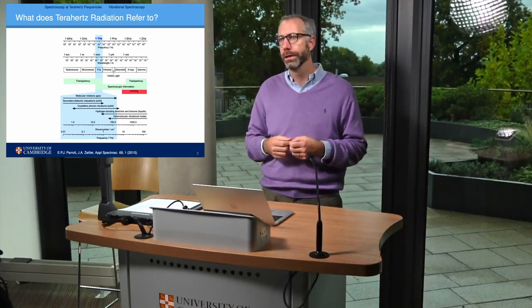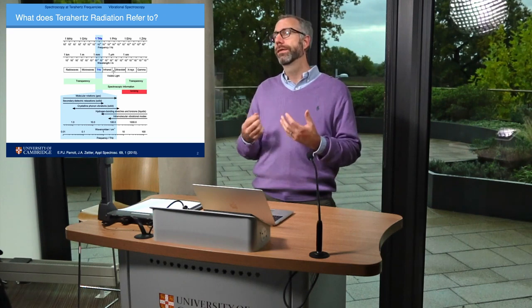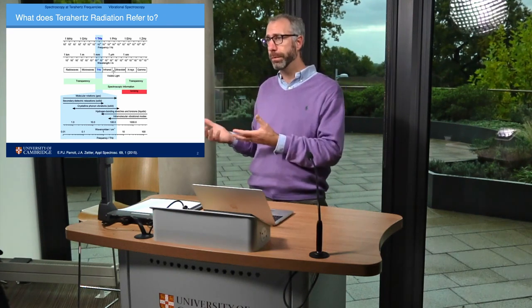As a result, we obtain the absorption as well as the refractive index spectrum, and we can thus think of the method either as a high-frequency extension of dielectric spectroscopy or as a low-frequency extension of infrared spectroscopy.